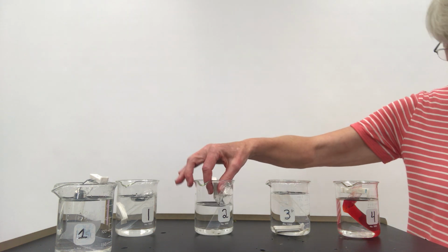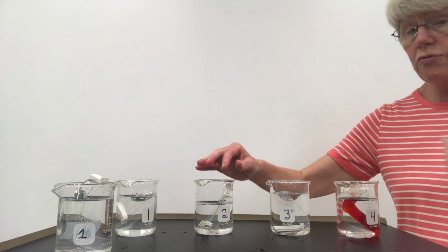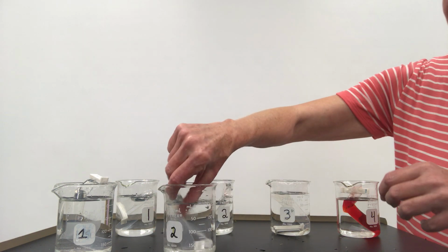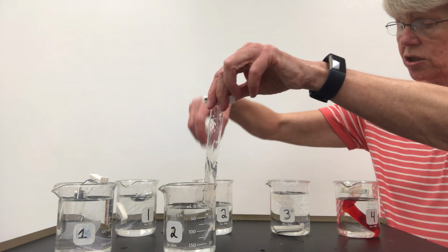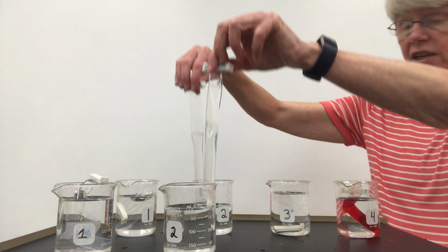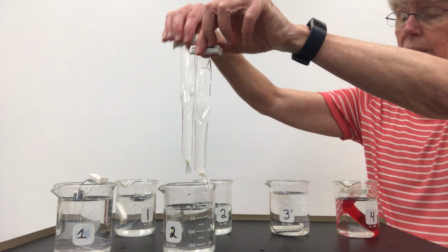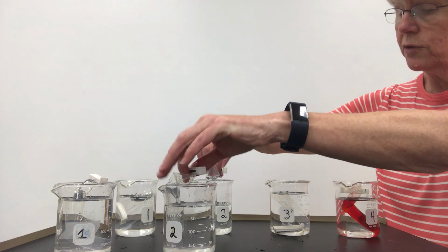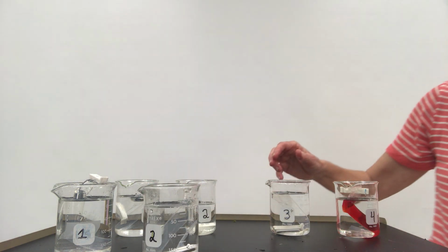Now we are going to look at number 2. Number 2, remember, is in the isotonic solution. Sucrose in the sac, sucrose in the beaker, and we should see no real change. Maybe a little bit of change, not much. Again, we'd weigh it, find out that there was very minimal weight gain, so that means that the solution did not move into or out of the sac at any particular rate.